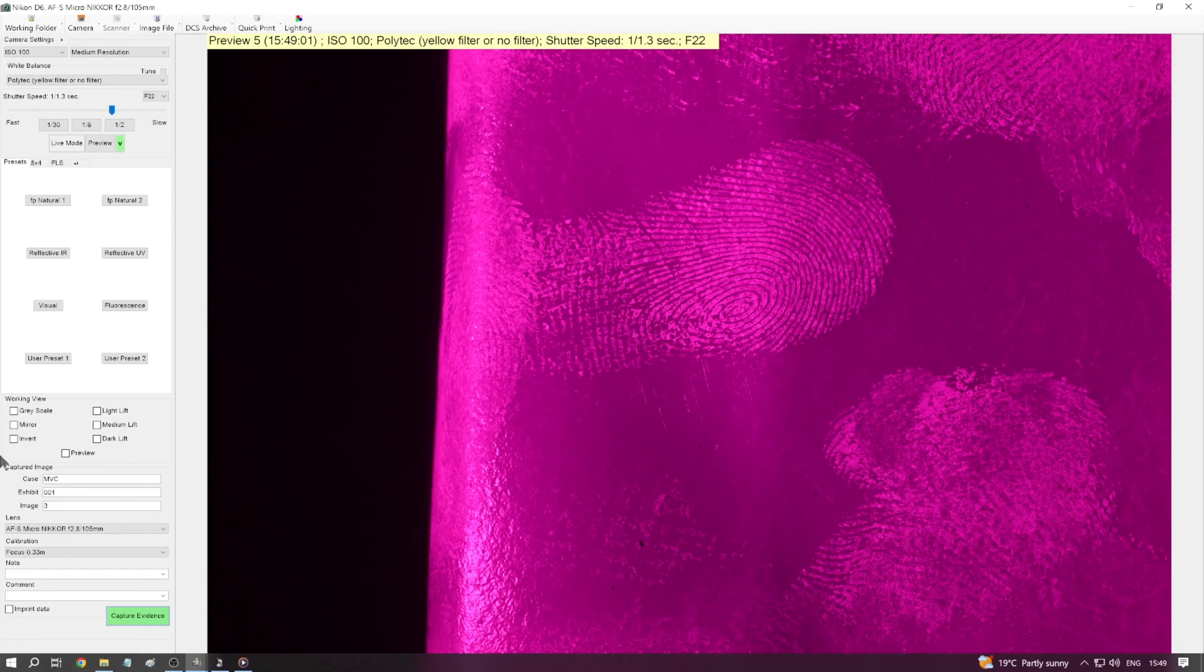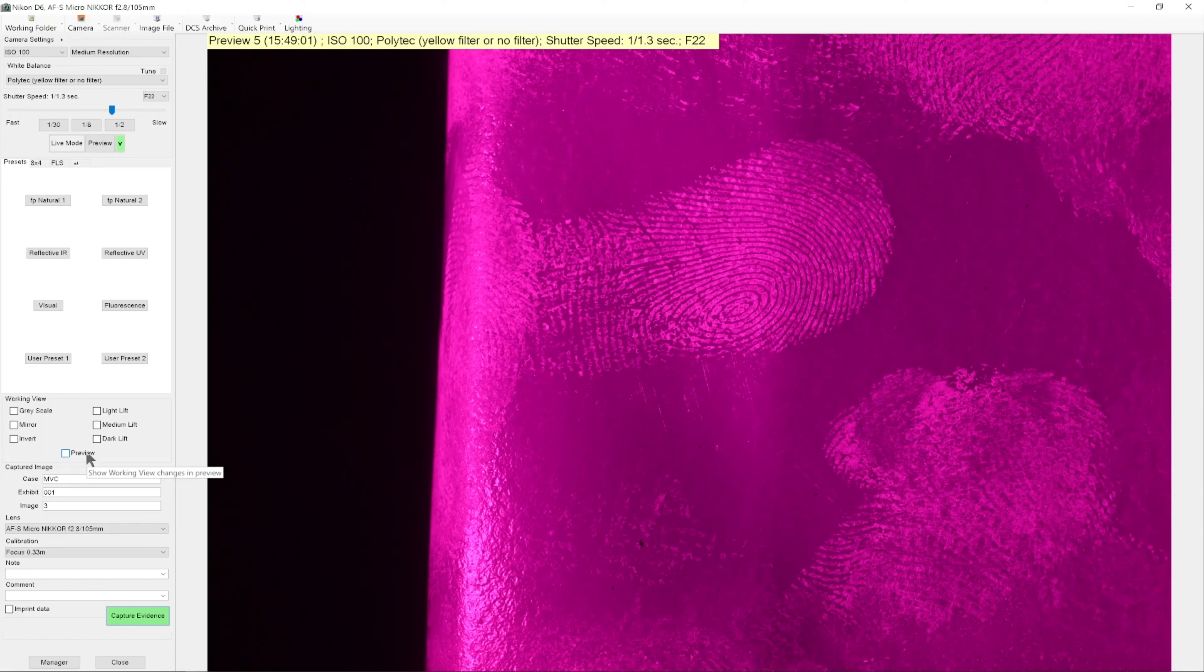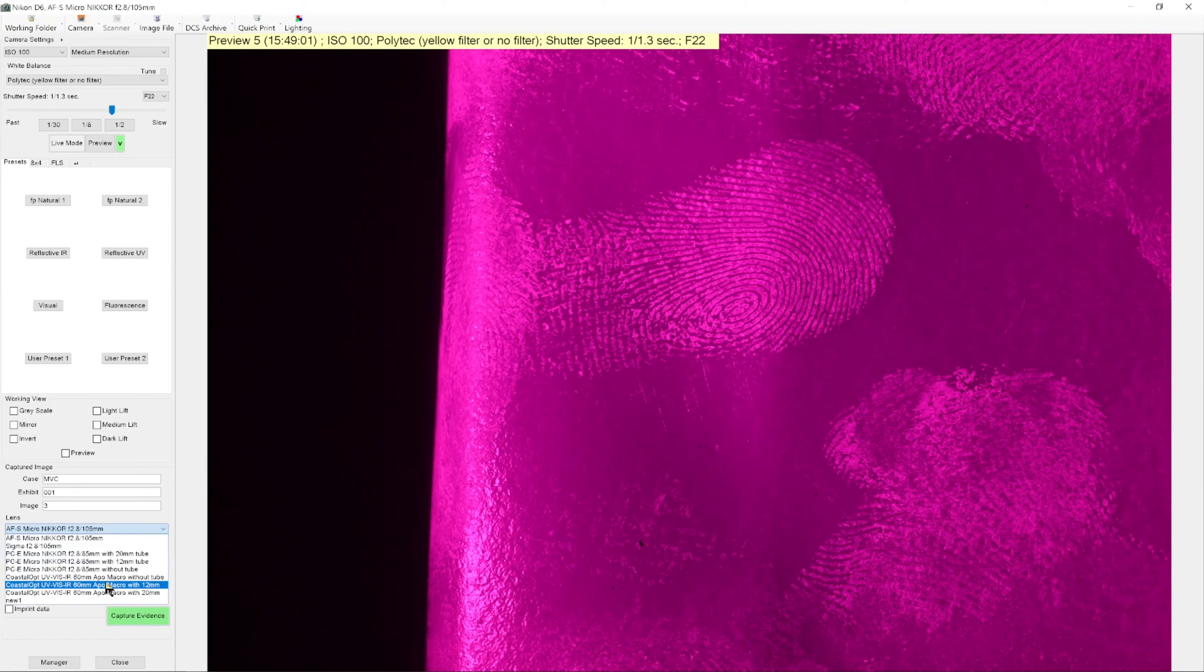With regards to software enhancements, for this particular finger mark, there isn't really anything that we need to do besides grayscaling and inverting the image.